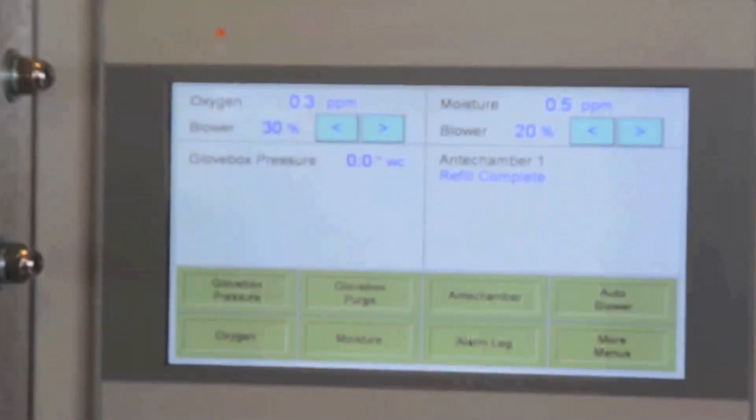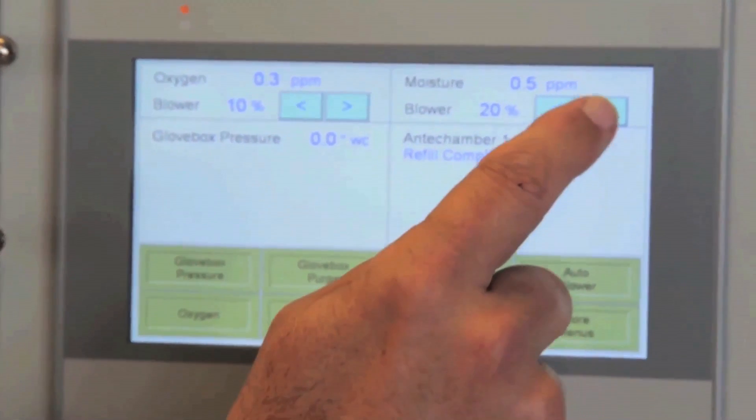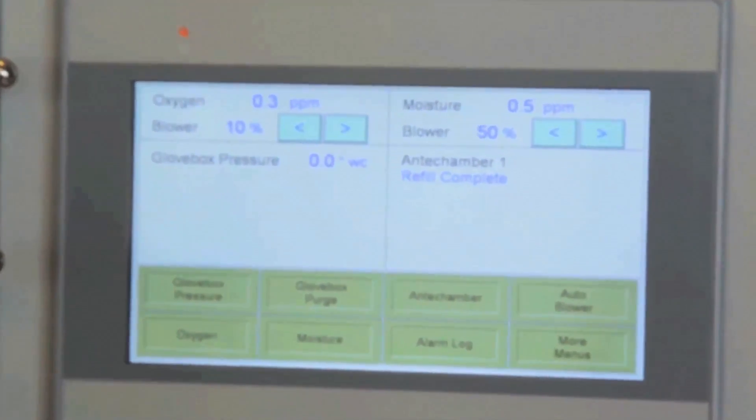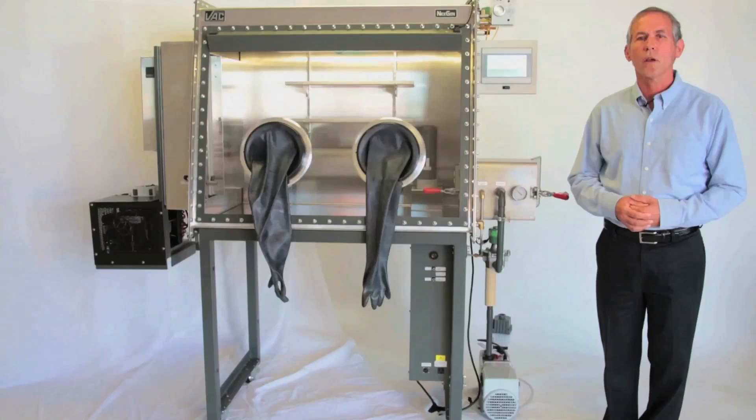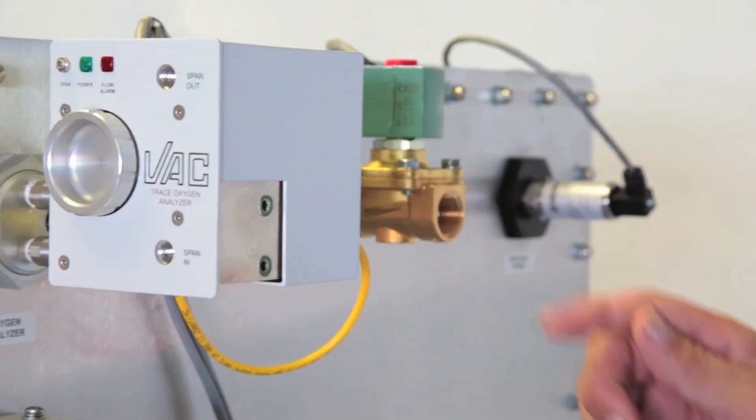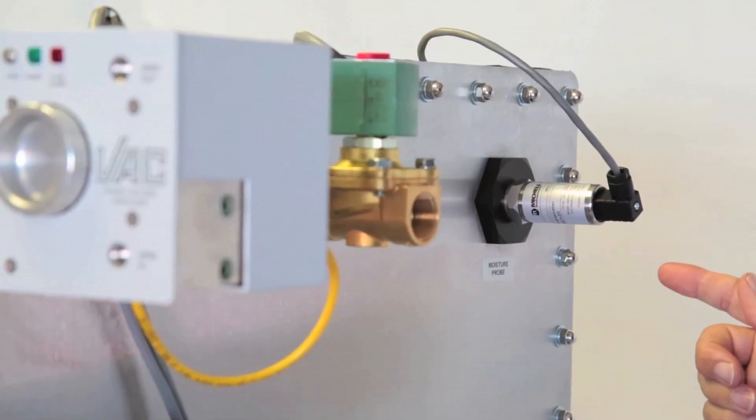The user-friendly touchscreen panel makes monitoring and controlling the NextGen simple. In addition to our standard automatic glove box pressure and purge functions, the NextGen allows simultaneous circulation blower speed control, which will automatically change the blower speeds based on readings from the optional oxygen and moisture analyzers.